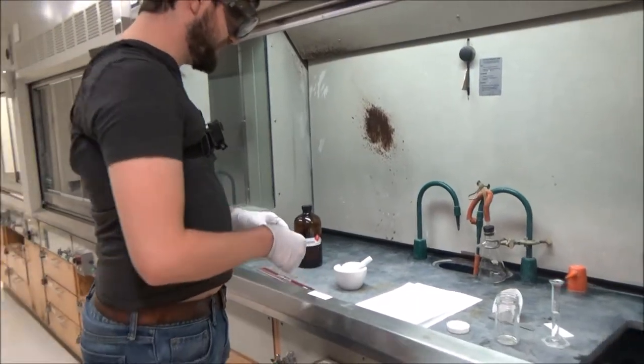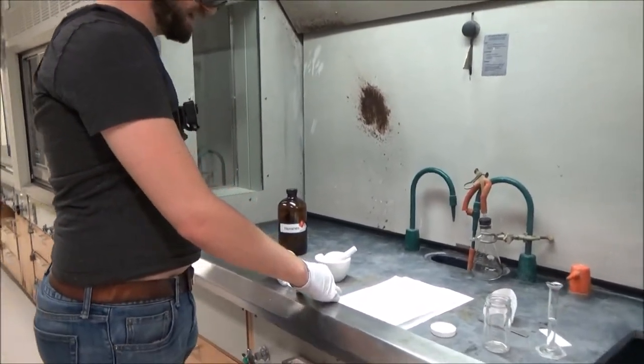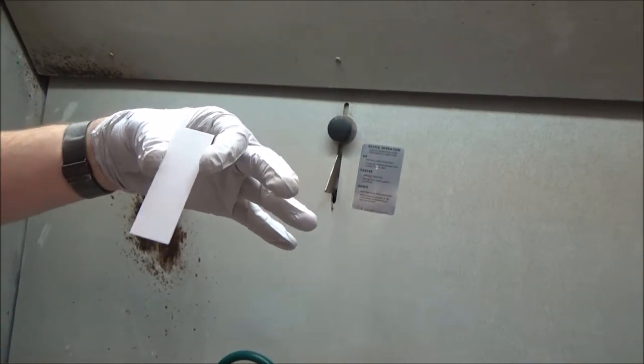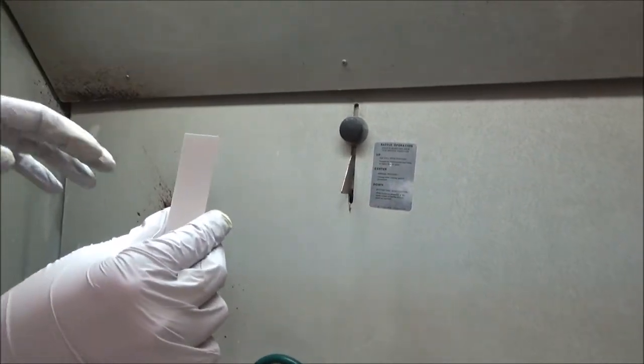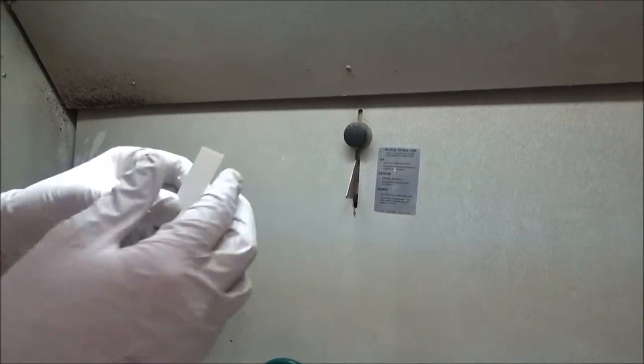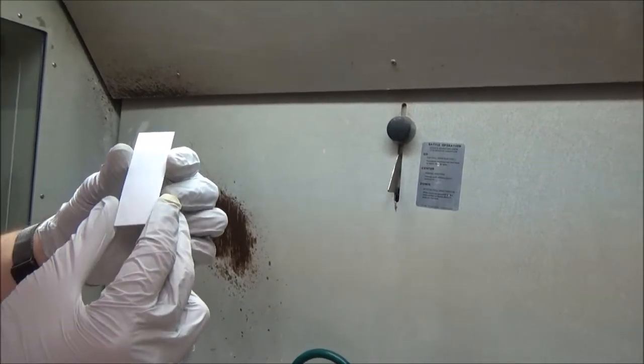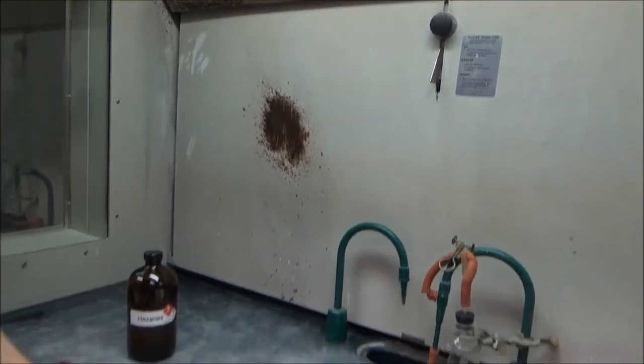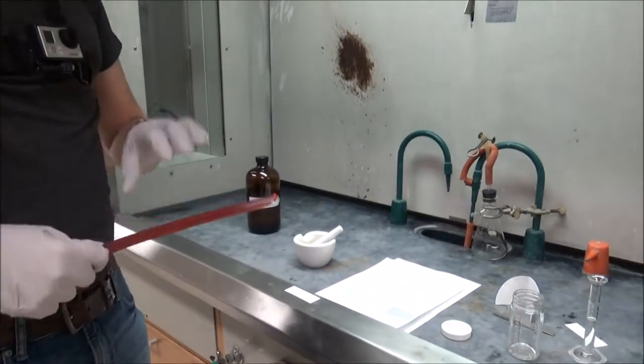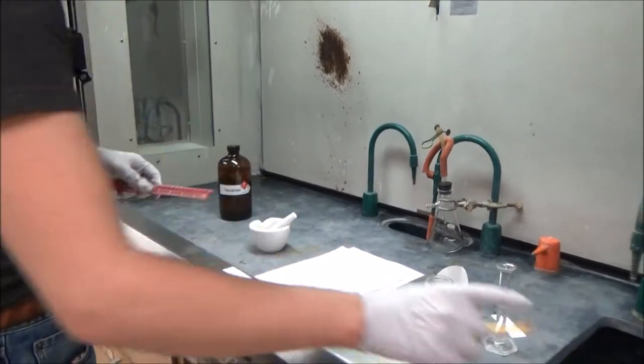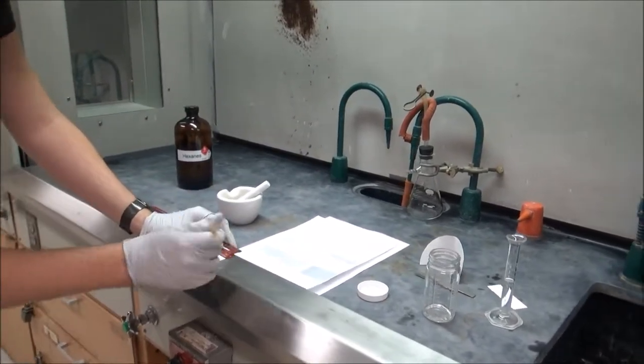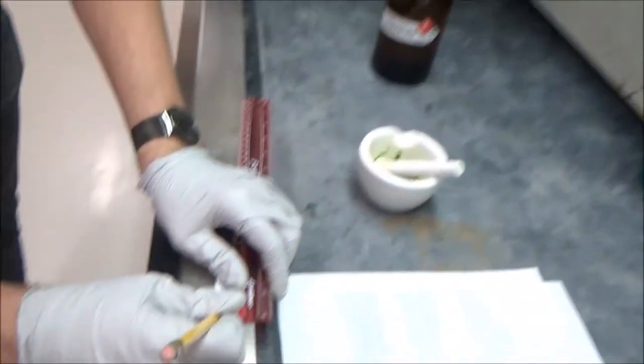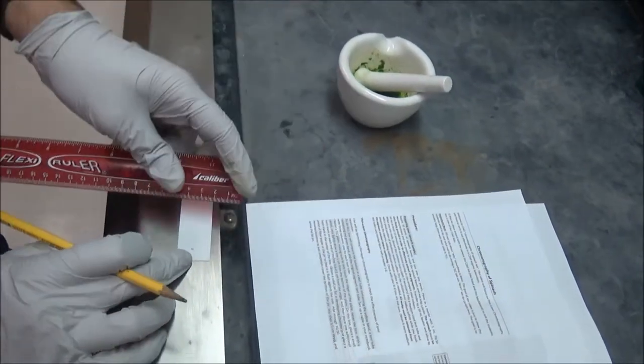The first thing I need to do is get a TLC plate, and I already have one prepared. You can see this tall rectangular plate has two sides: an opaque silica side and a shiny plastic side. Everything that we do on this plate we will do on the silica side. I'm going to draw a small line one centimeter above the bottom and extend that across the entire plate.